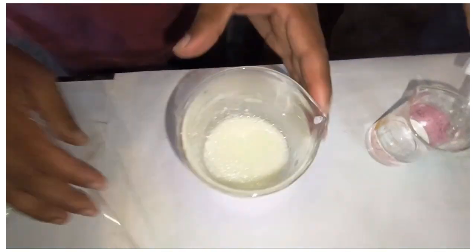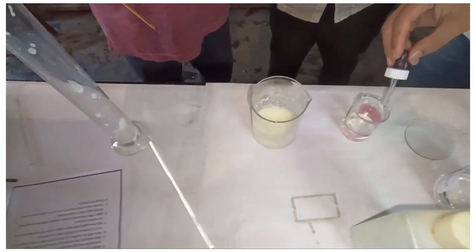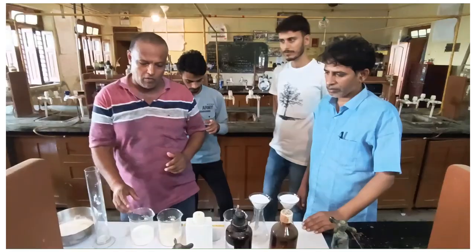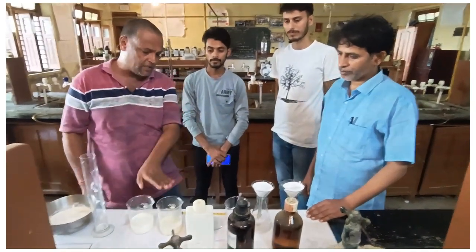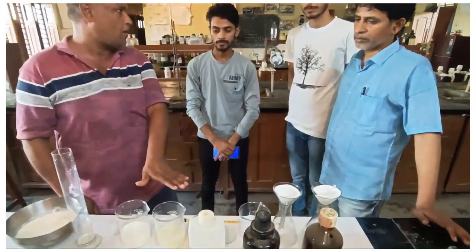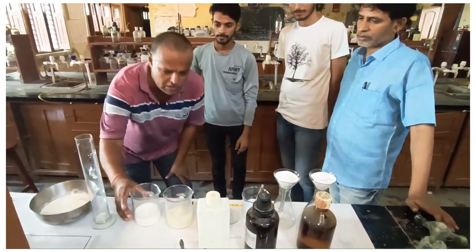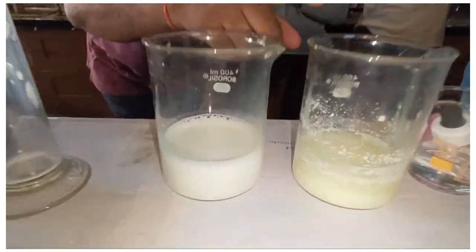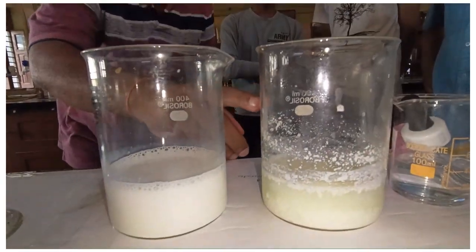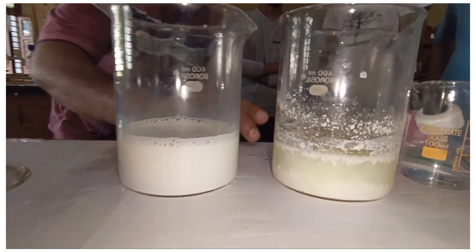Now see the temperature. I hope the temperature will remain the same. Now, after 10 minutes, we see the casein deposited or settled down at the bottom of the beaker. By addition of the acetic acid, the settled casein after 10 minutes is near about this.